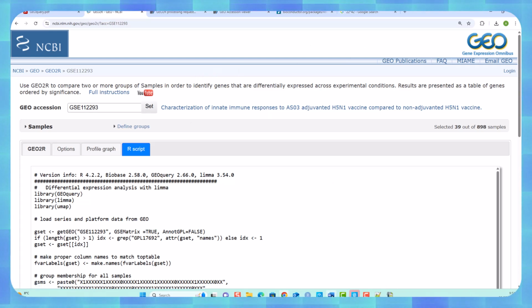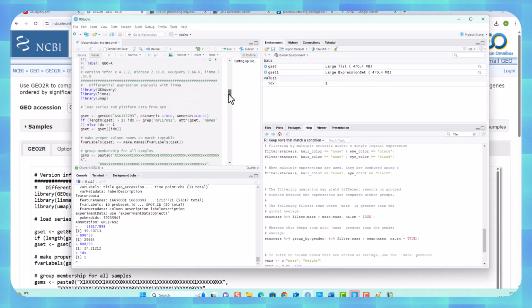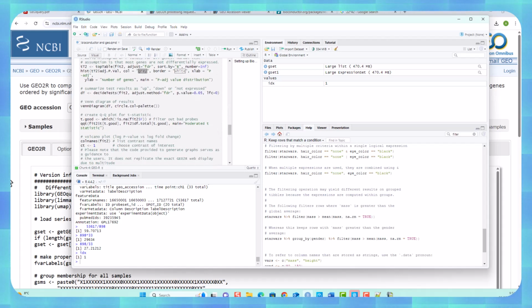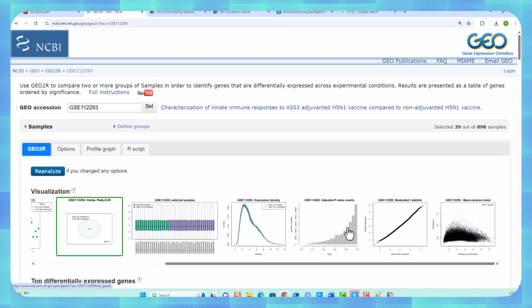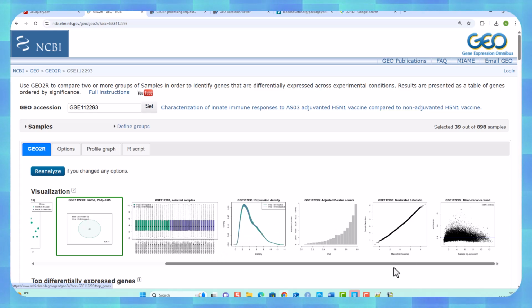I can repeat exactly that same analysis using R just by running that set of script. If I run that, it will give me all of these output graphs and the results. It'll give me all of this in R itself, which is better because I'll get higher quality images than I've got here, and I can then put them into my final documents. So that's the basic analysis.